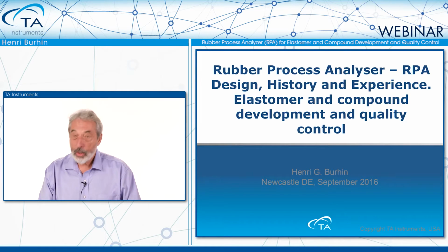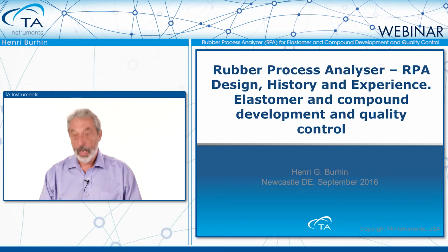Henri? Thank you, David, for this introduction, and we're going to start with the presentation. I'm going to talk about an instrument which is called Rubber Process Analyzer, or RPA. I'm going to discuss the design, the history, and all the experience which have been gained so far on elastomer, compound development, and quality control.